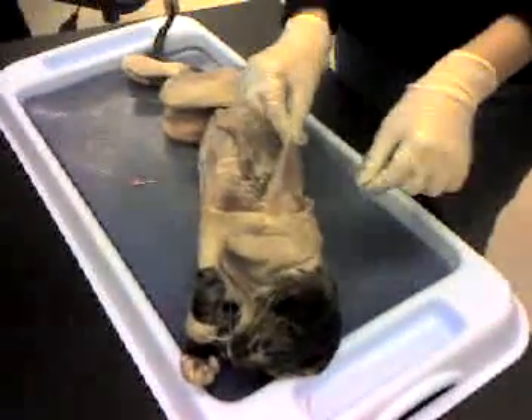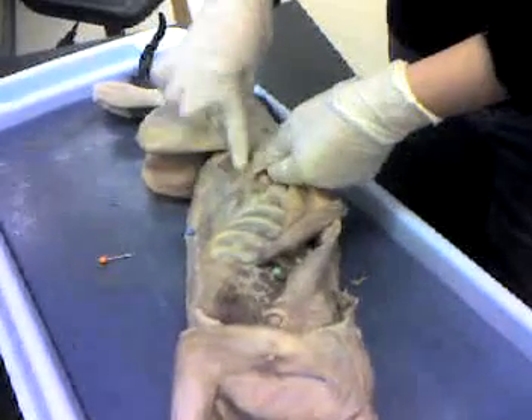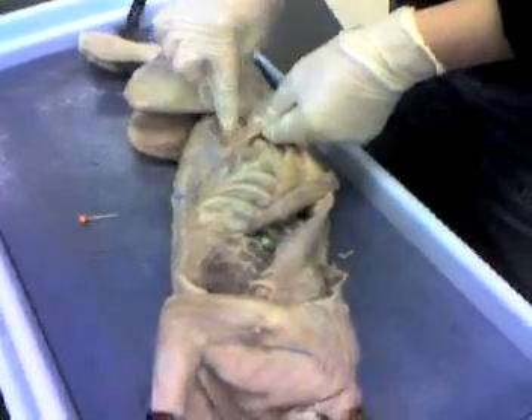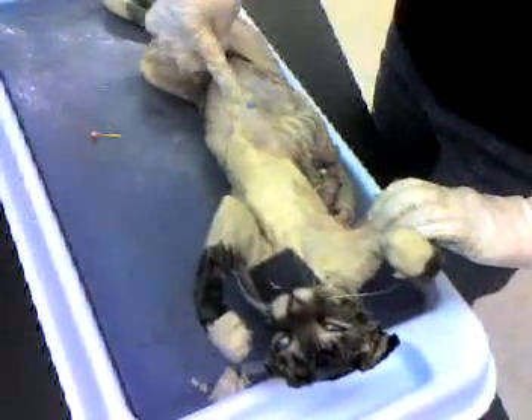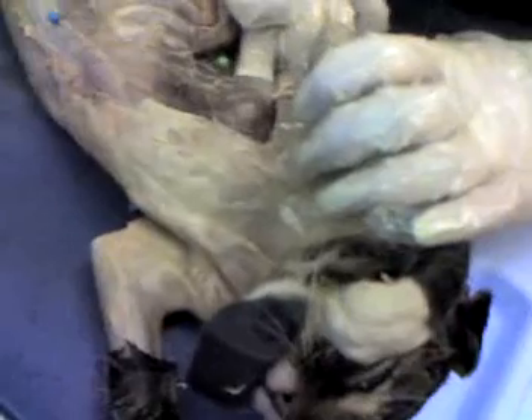Here's another video of the cat. That right there is the latissimus dorsi, and then that's the external oblique, internal oblique, and the transverse abdominus. Down the midline of the body is the rectus abdominus. And then those, they look like finger-like projections underneath the latissimus dorsi, are called the serratus anterior.